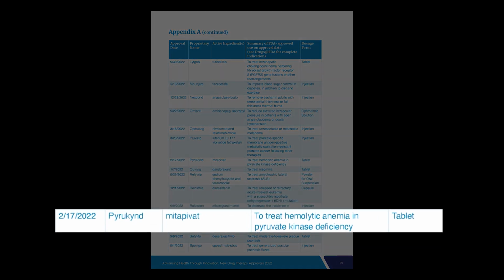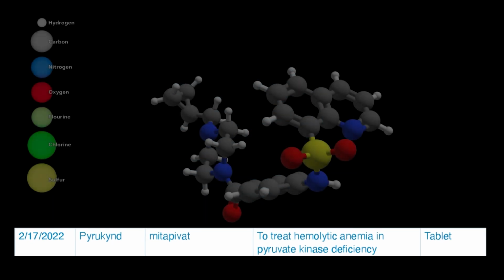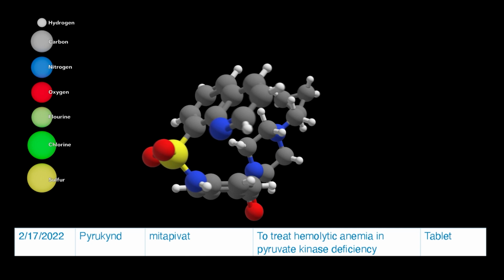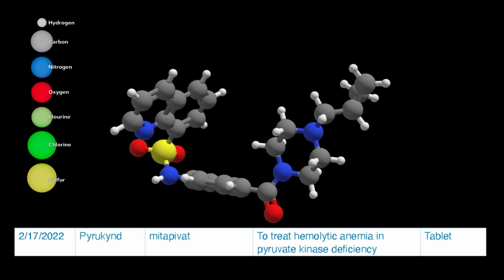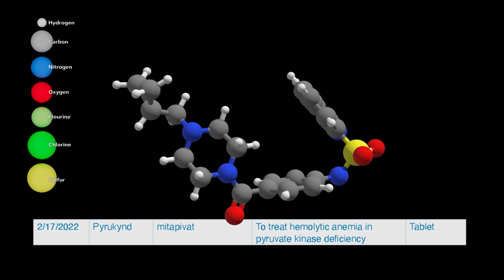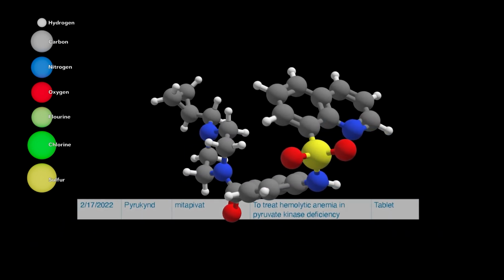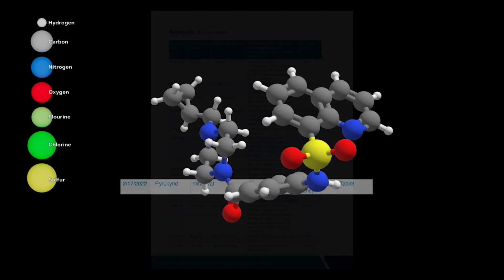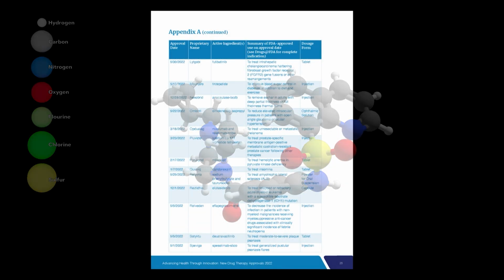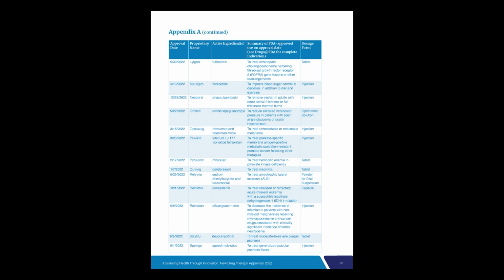Step 4. For structure elucidation. HPLC, coupled with various detectors such as mass spectrometry, ultraviolet detectors, or fluorescence detectors, aids in the identification and structure elucidation of drug compounds. By comparing retention times, spectra, and fragmentation patterns with reference standards or databases, researchers can confirm the identity of the compounds.